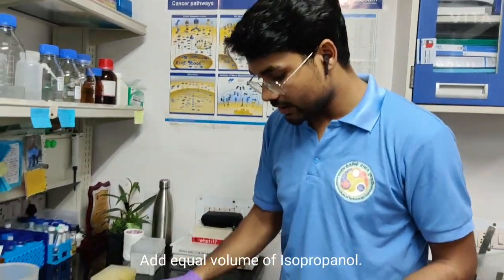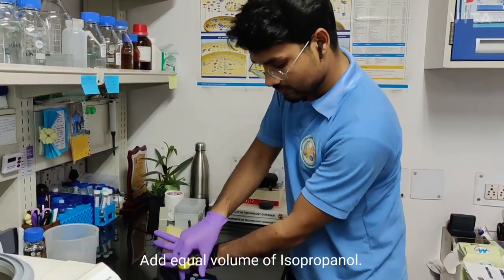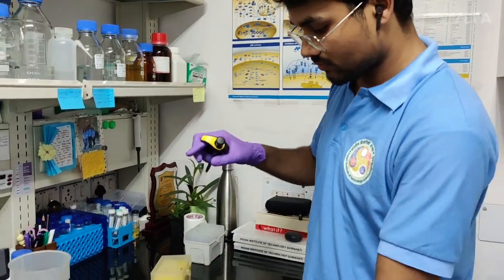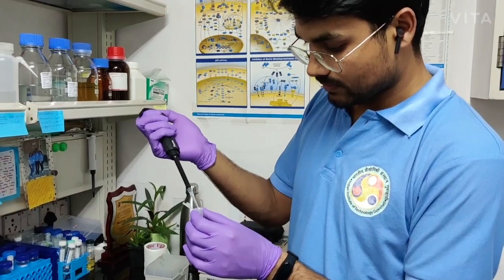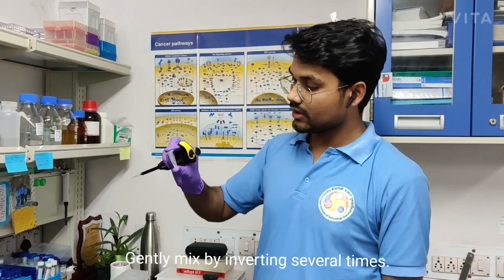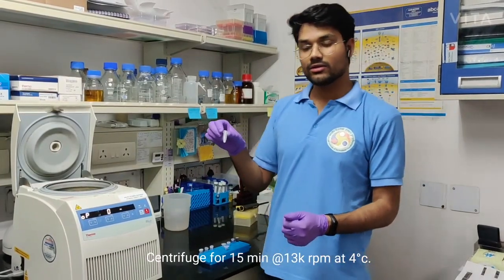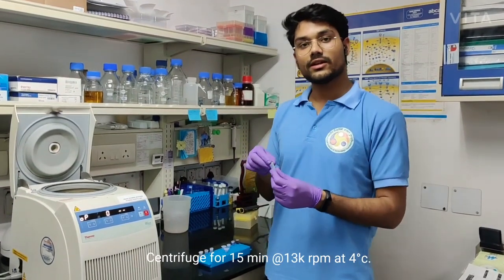Then we will add an equal volume of isopropanol into this. Then gently mix the tube by simply inverting it. Now we just incubate this tube at room temperature for 15 to 20 minutes. Now the incubation is done. We will centrifuge it for 15 minutes at 4 degrees Celsius at 13,000 RPM.